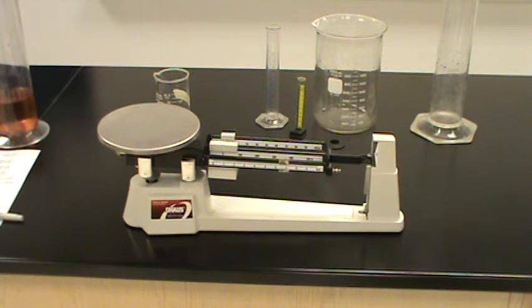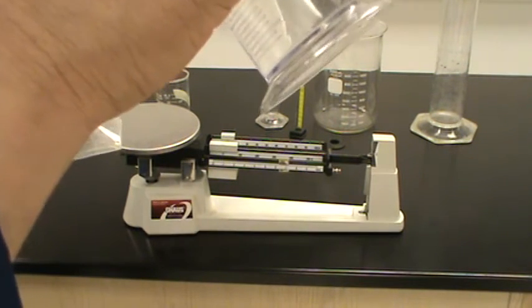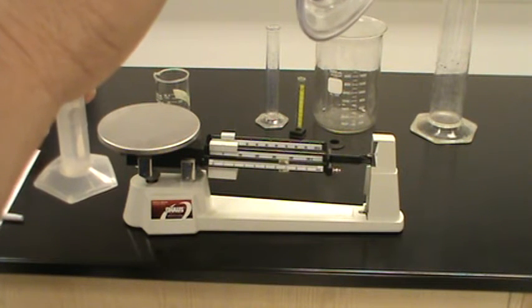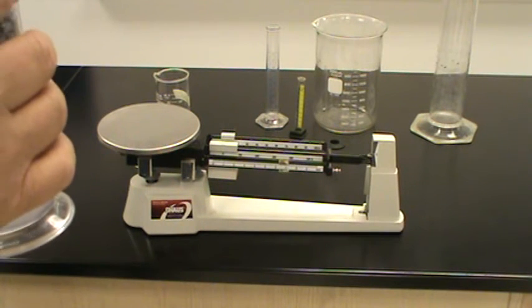Now, I'm not going to use the colored water because it's got food coloring in it. I'm sure it wouldn't throw it off that much, but I have a container of water here, and we're going to measure out 10 milliliters. There we go, past 5. Oops, just over 10. Let me put some of this back.